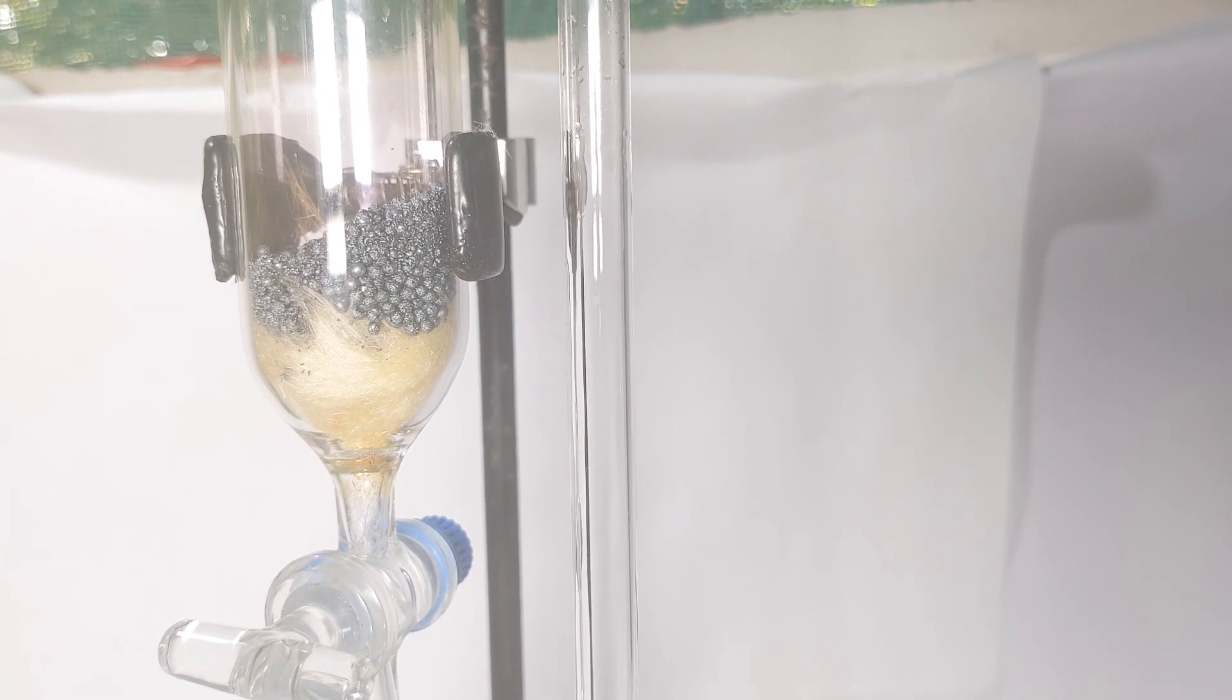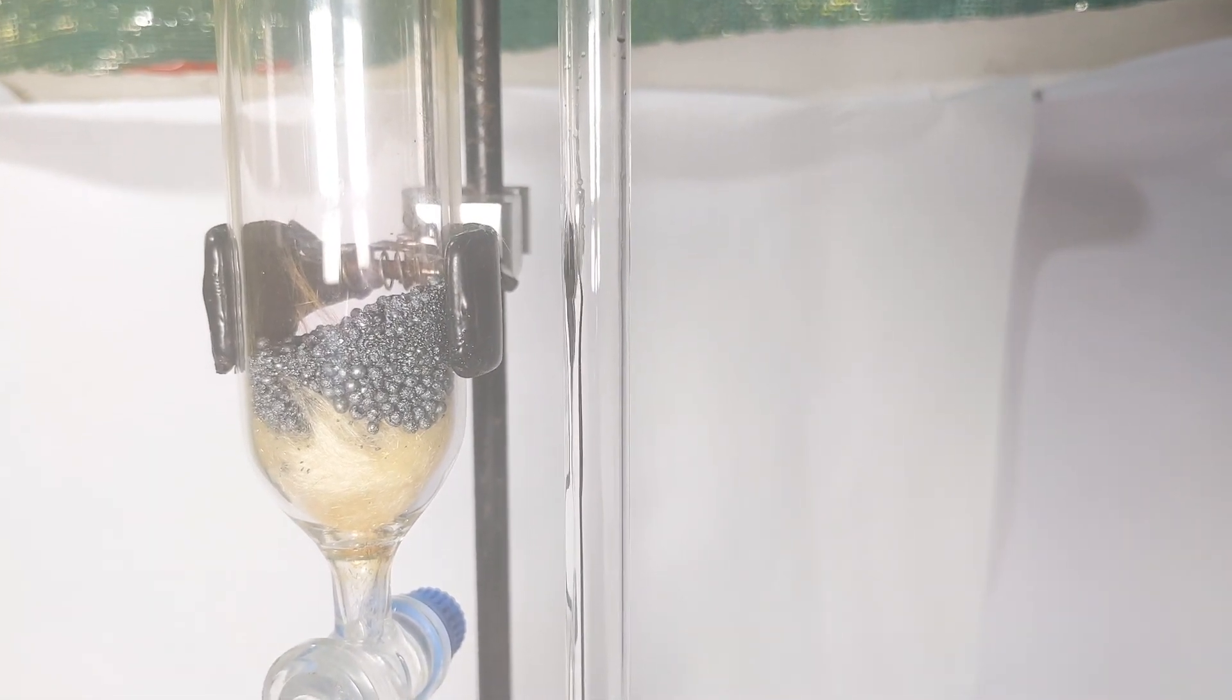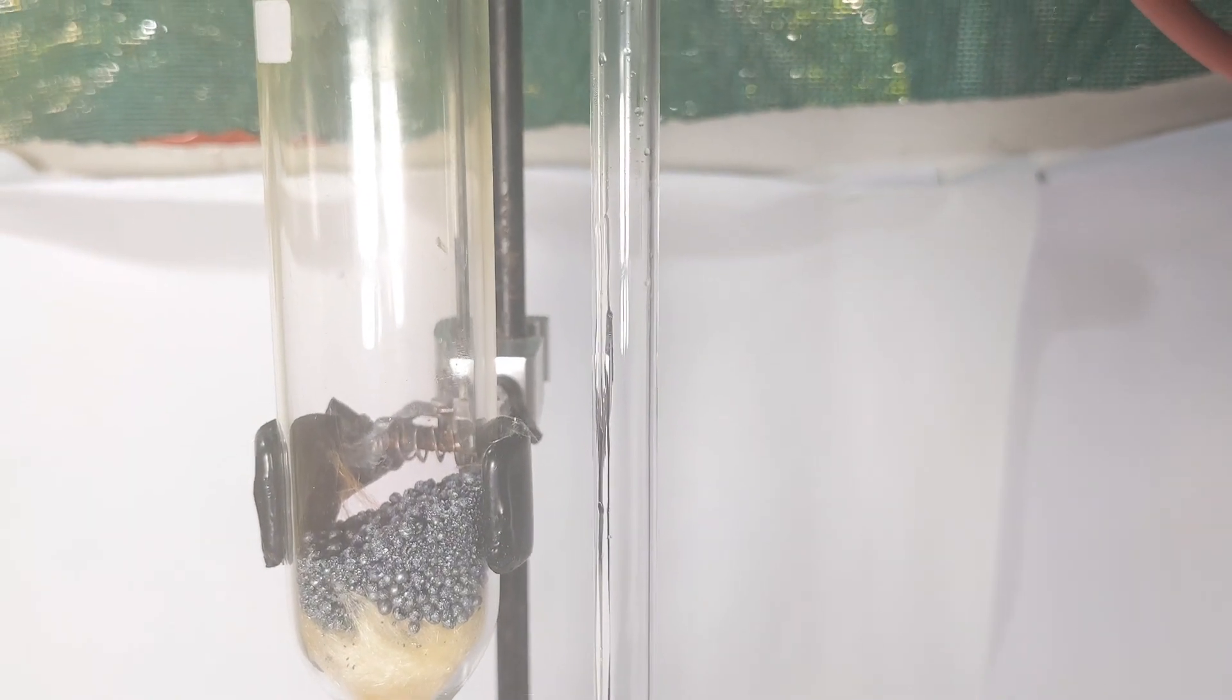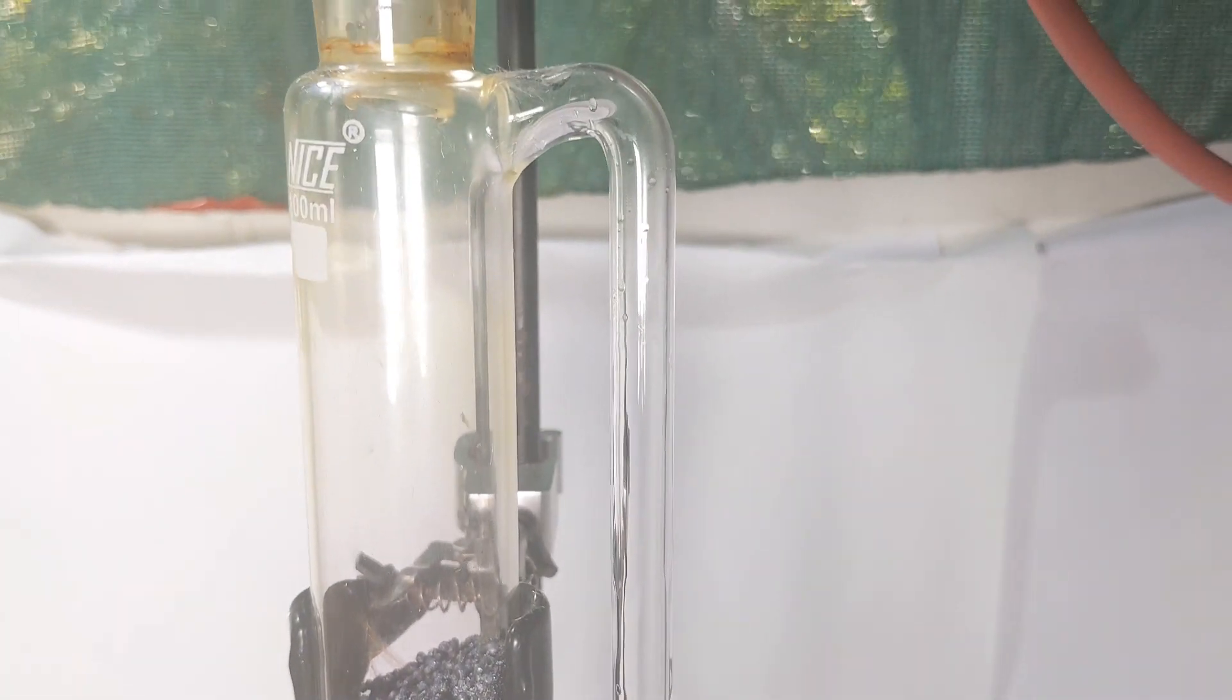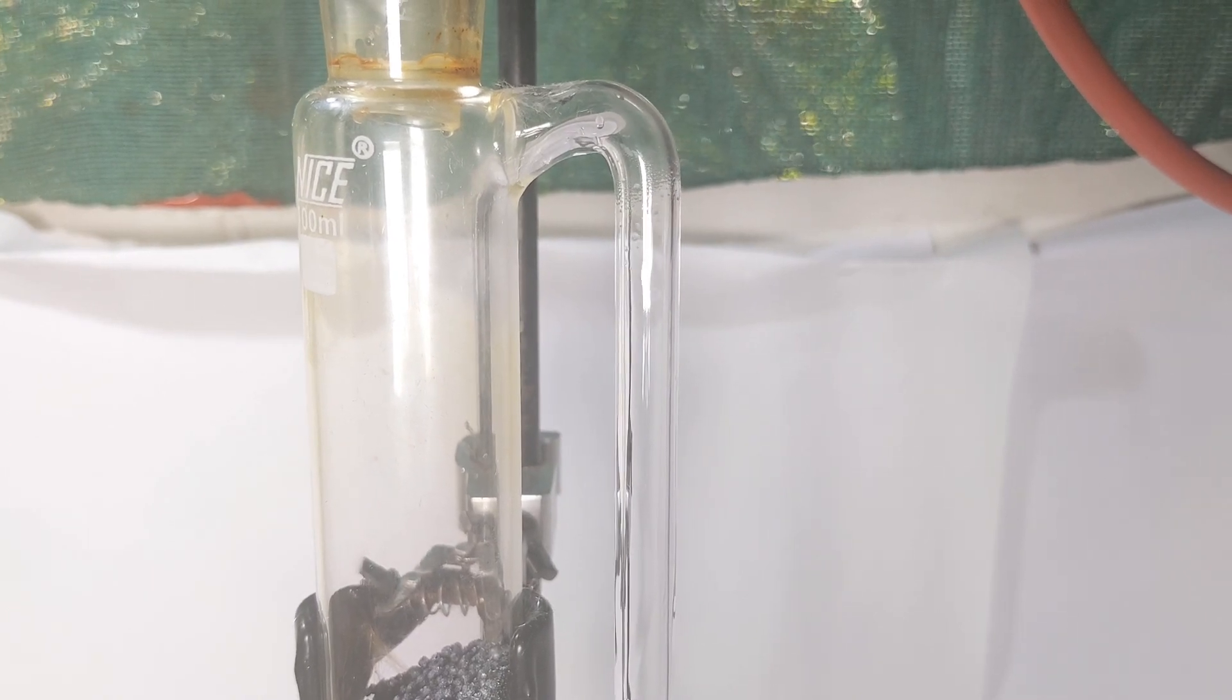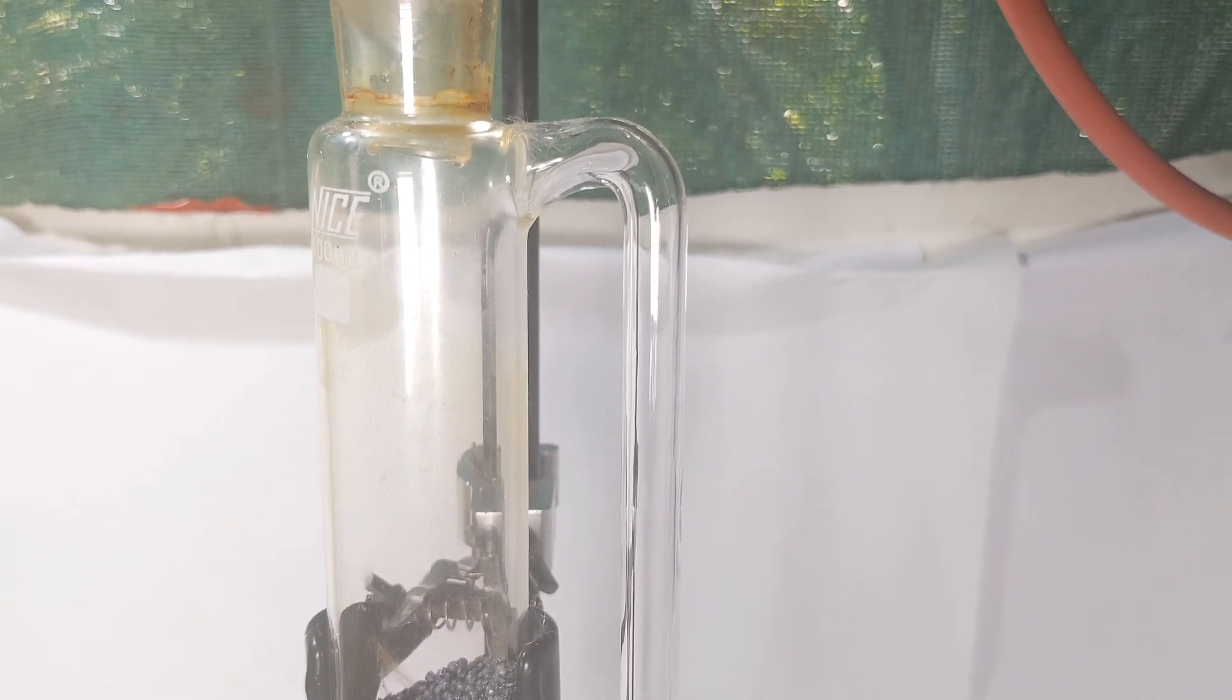It does not go further up because of the condenser column placed on top of the funnel which has cold water running through it. Instead it goes down into the funnel, condenses to liquid and dissolves the iodine.